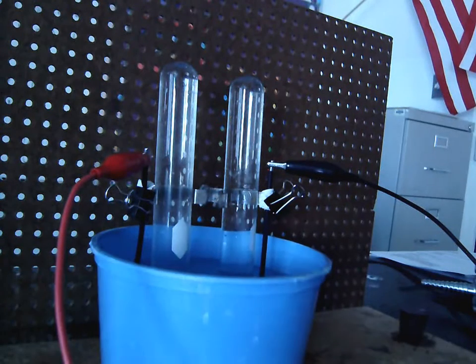Lab 6.2 is called the Decomposition of Water. Before we get started, there are a few things that I should explain, just so you understand what you're looking at here. First of all, let's think about the title of the lab. The title of the lab is the Decomposition of Water.